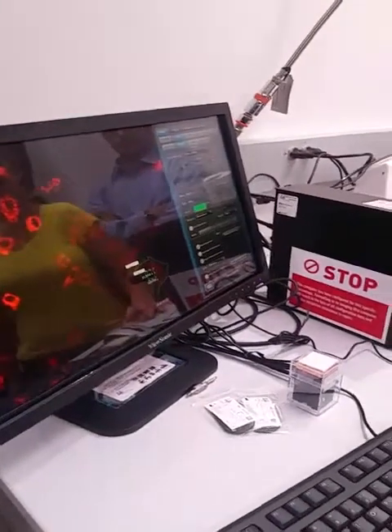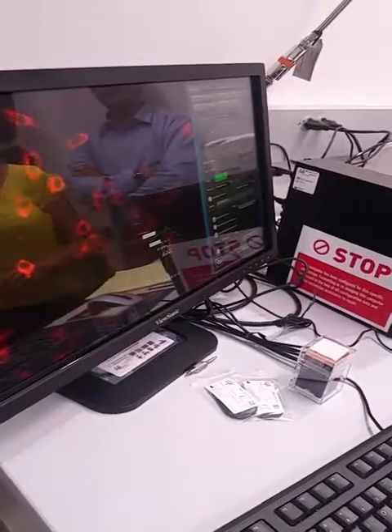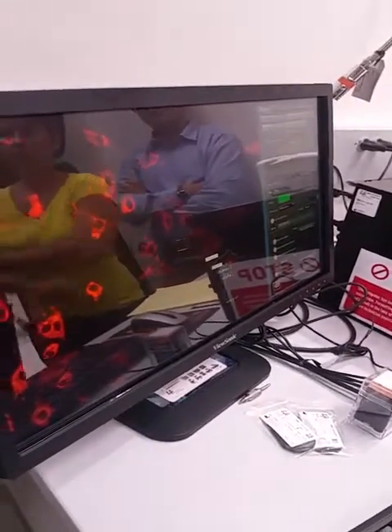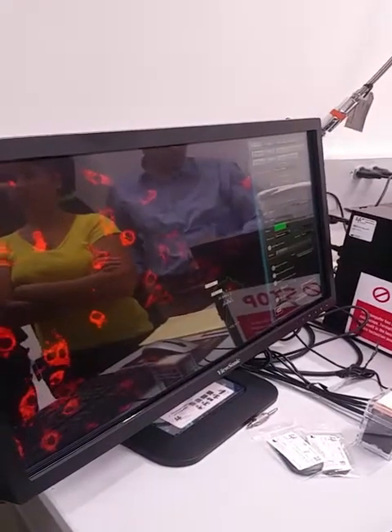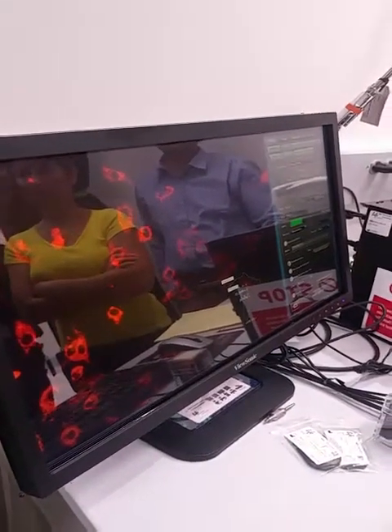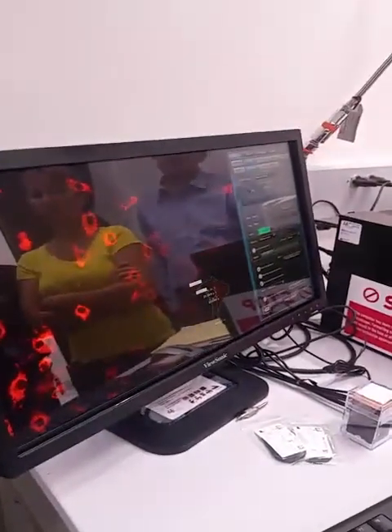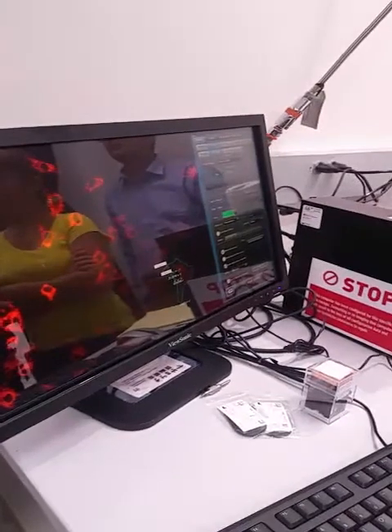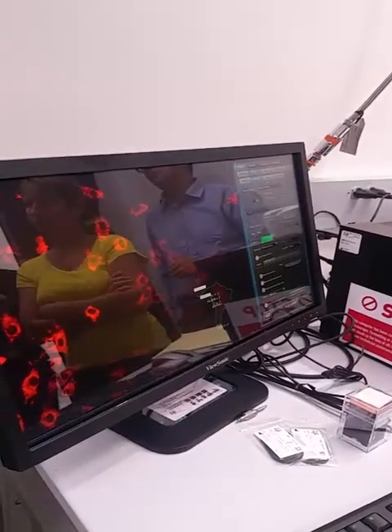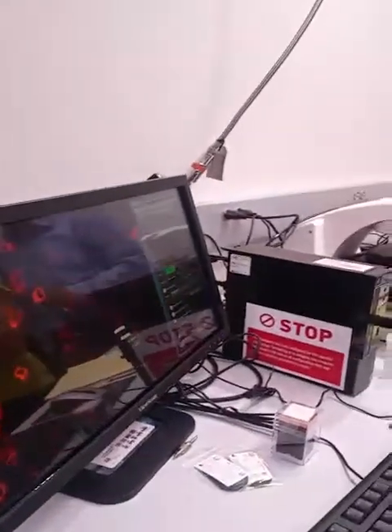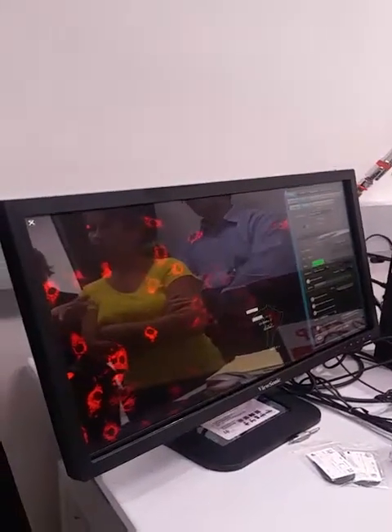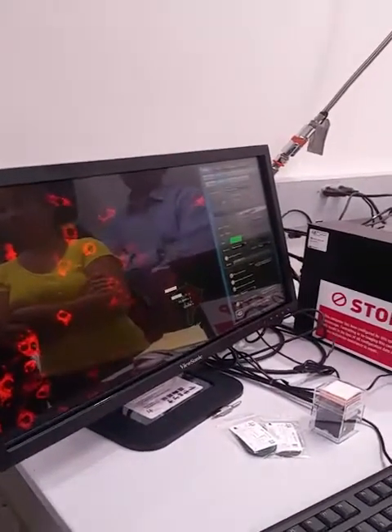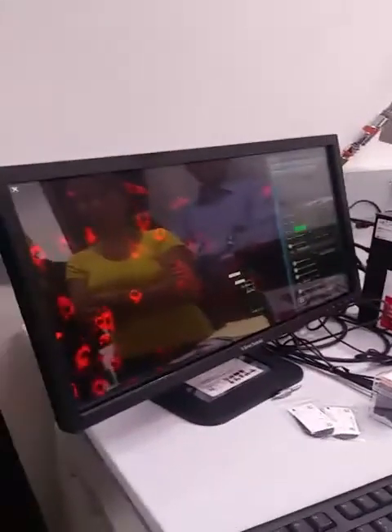You can scan your whole plate — say a 96-well plate — and set interval times for scanning the entire plate. You can do either time-lapse or a tile scan, but not both simultaneously. With time-lapse, you can specify multiple positions to image within each time point. You select whatever cells look interesting, and the system will remember those positions and collect data from them over time.